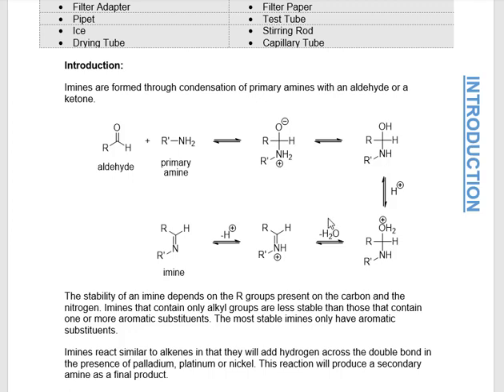Now, one of the biggest problems is we're going to reduce this imine, and so you really have two products here, the imine and then water. Why do I care? Why am I bringing that up? Well, with this water in particular, we do have a safety issue of concern when we reduce our imine using sodium borohydride, and I'll talk about that in a second.